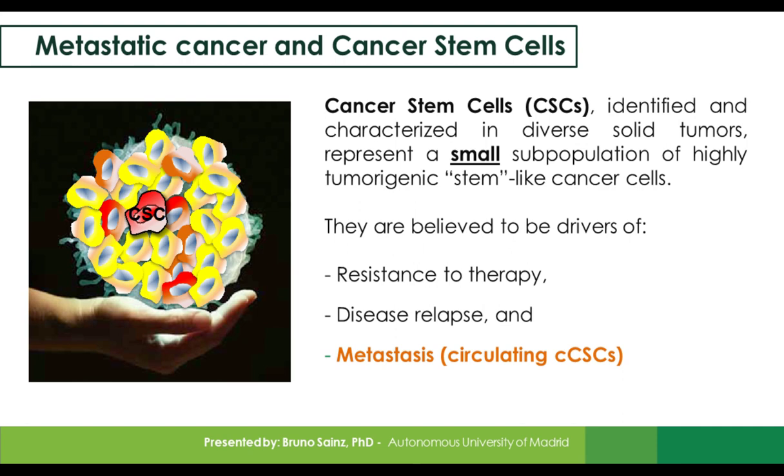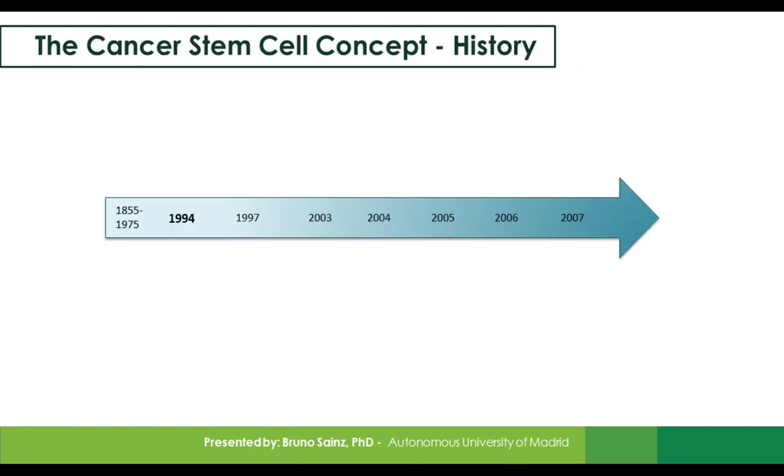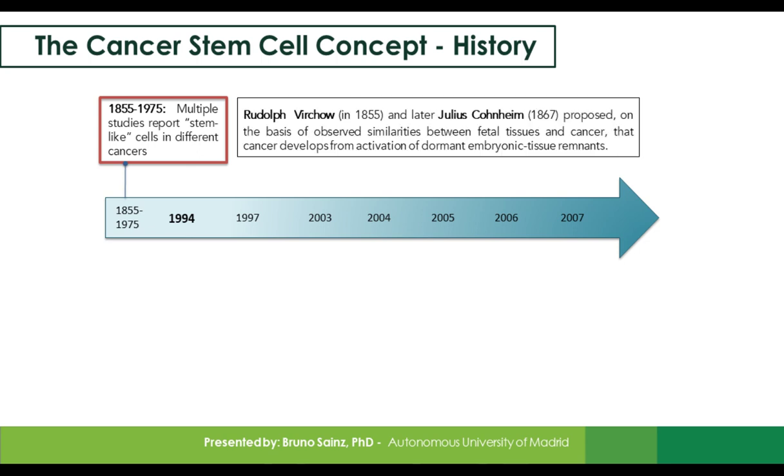Now, the cancer stem cell concept as a whole is not a very new concept. As early as 1855, there were multiple studies reporting stem-like cells in different cancers.